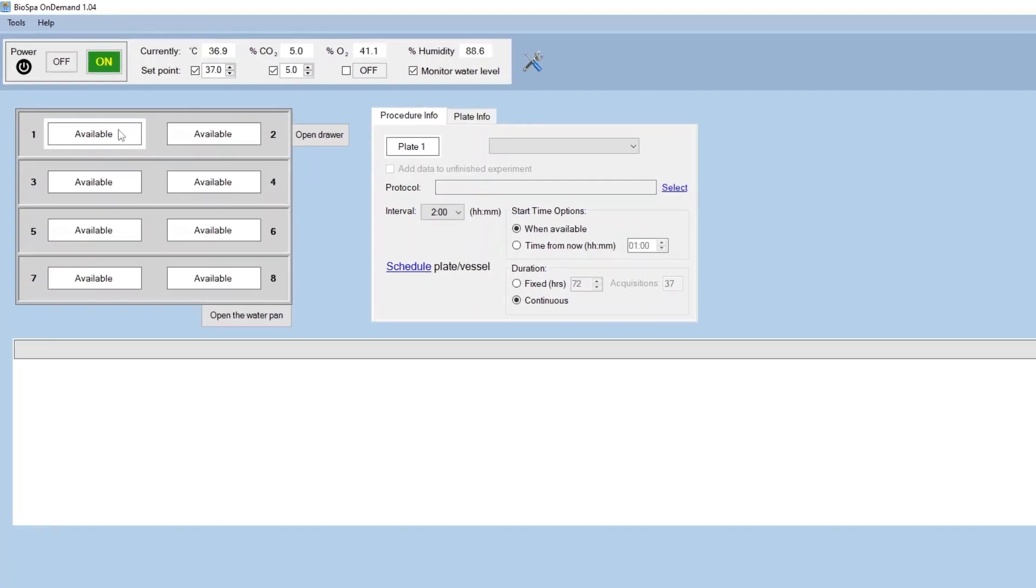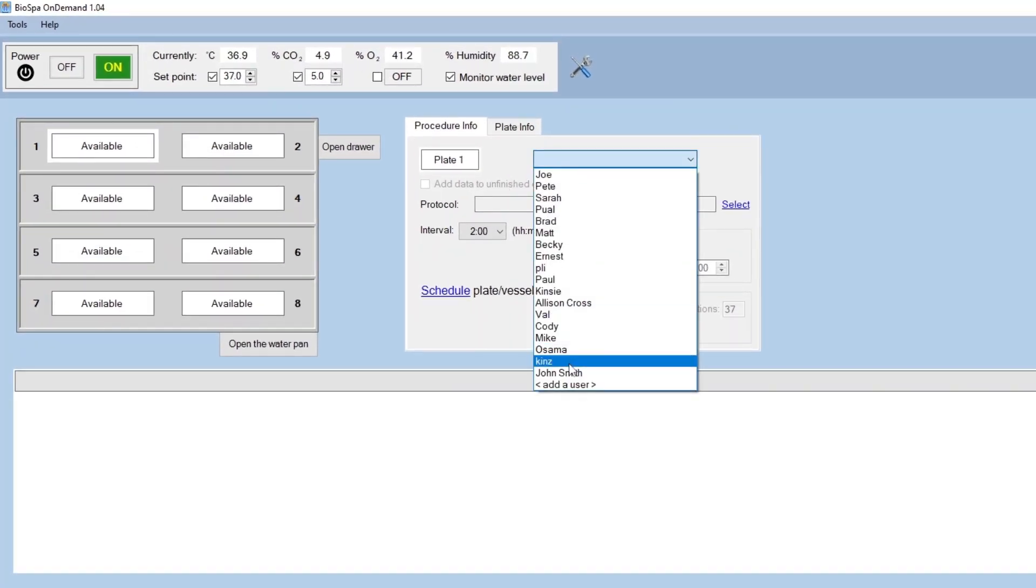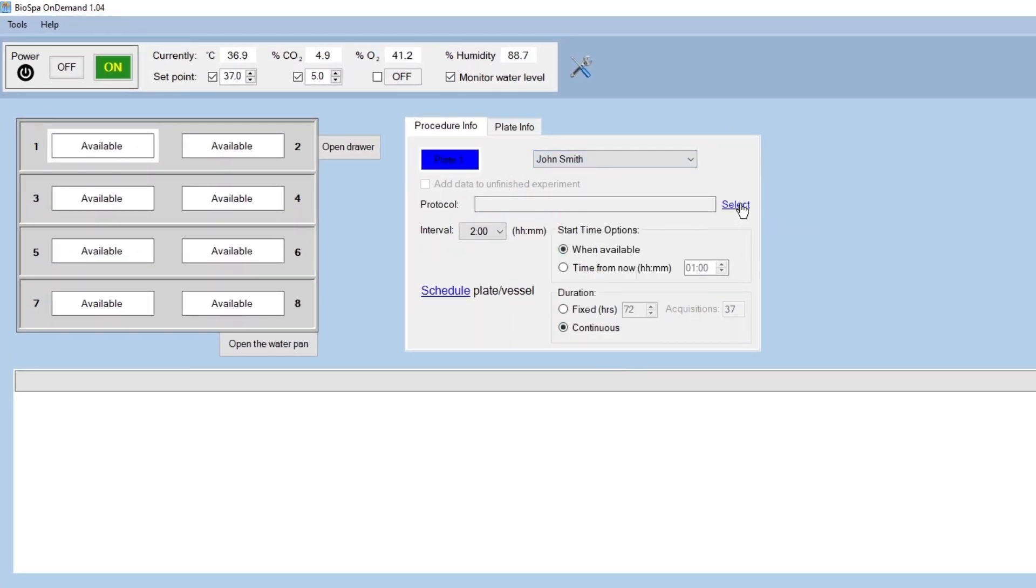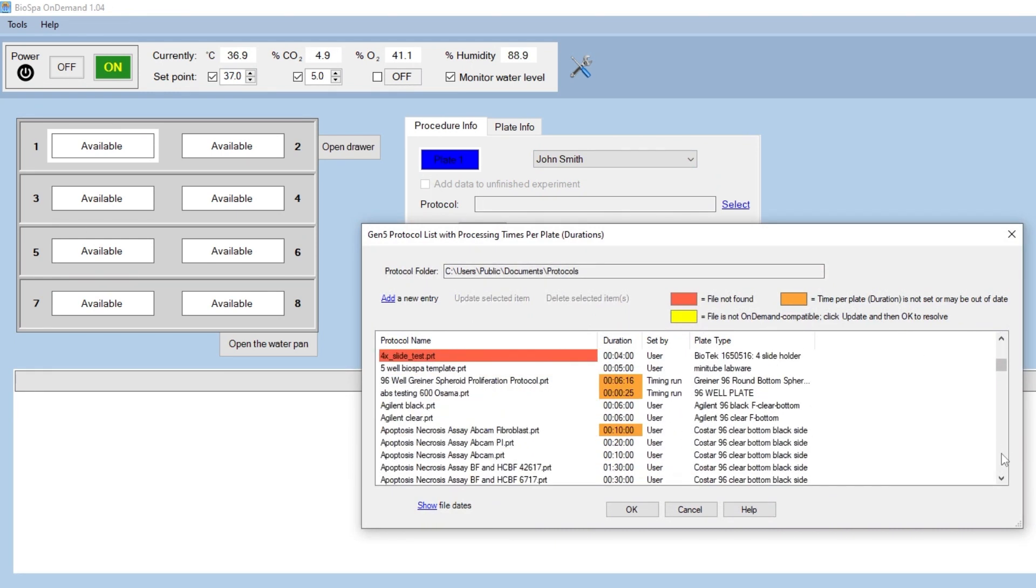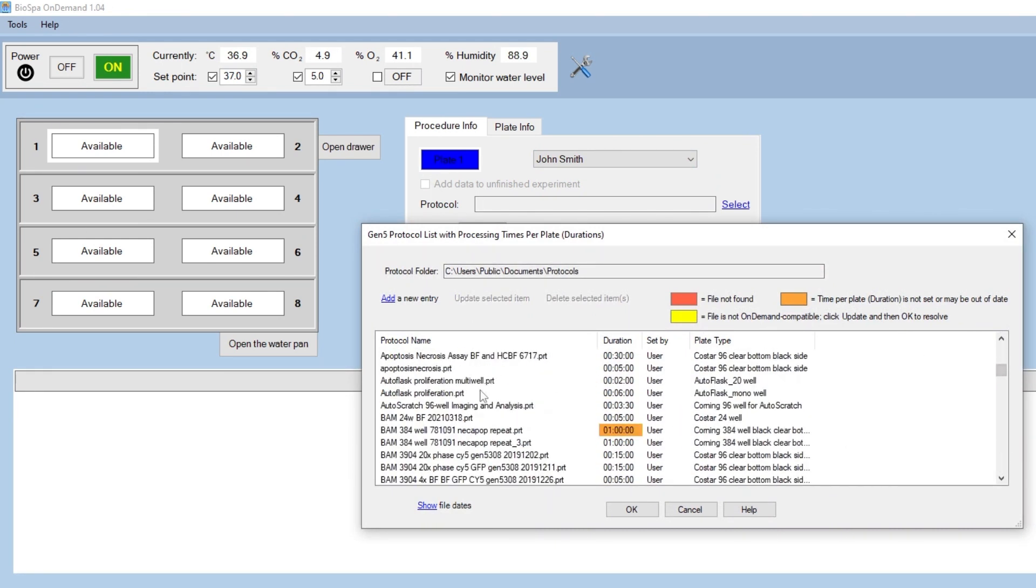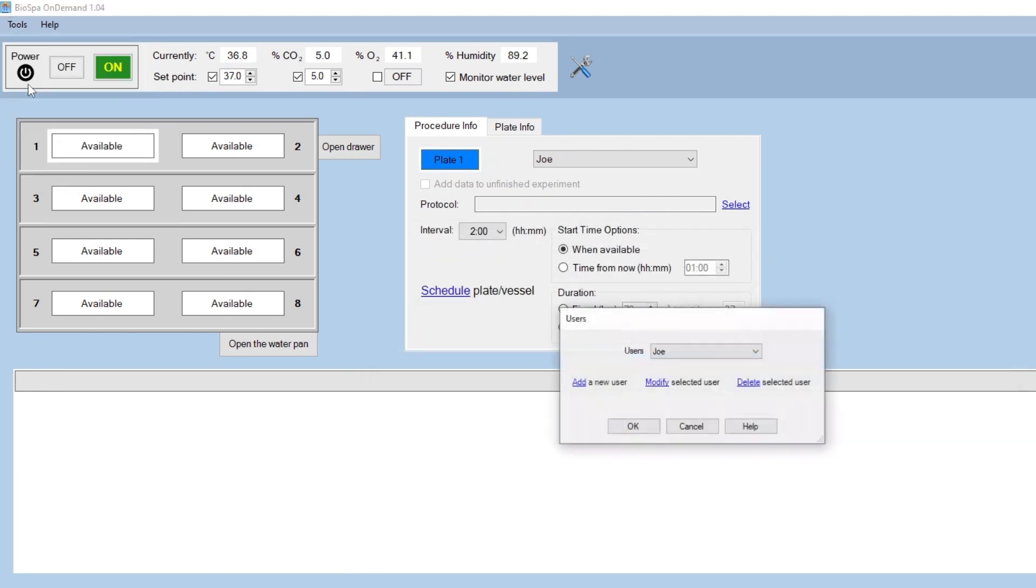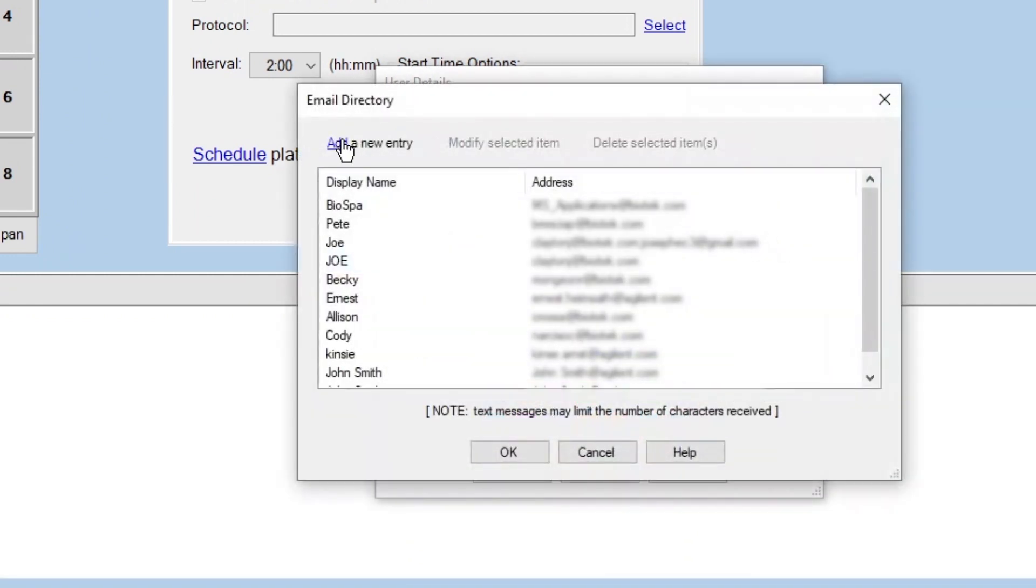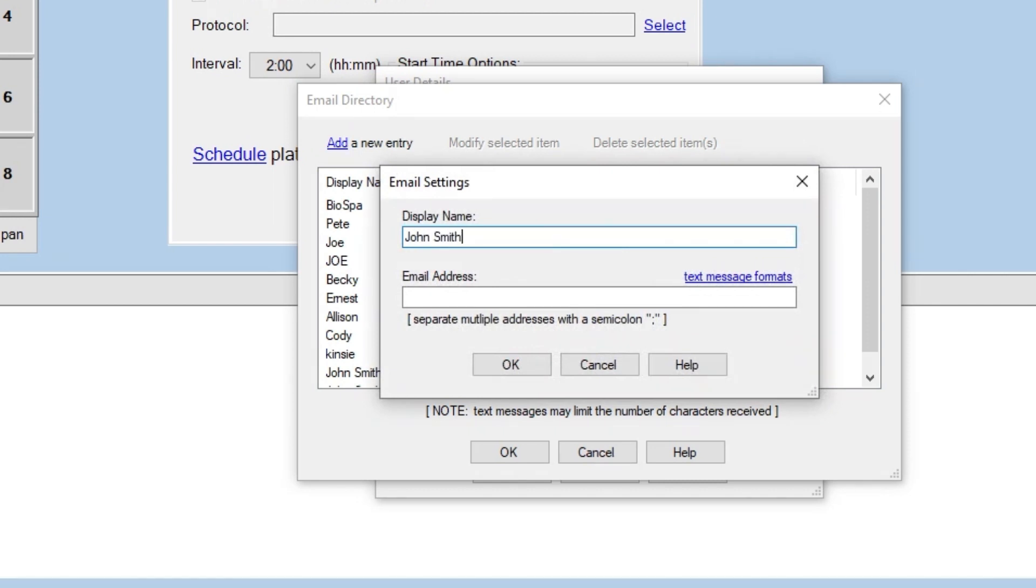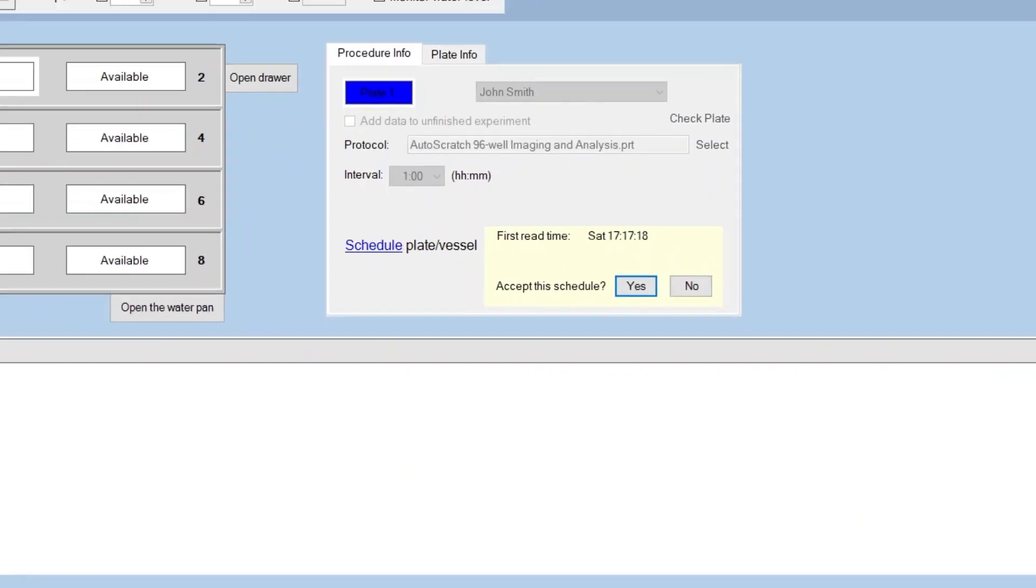In on-demand mode, multiple users can add new plates and start protocols as well as stop protocols and remove plates at independent times that meet theirs and their lab's own schedules. Each user can set up his or her own profile, which includes color coding to make identification of their protocols easy and efficient, as well as how they want to be notified when plates have been processed, either via email or text message.